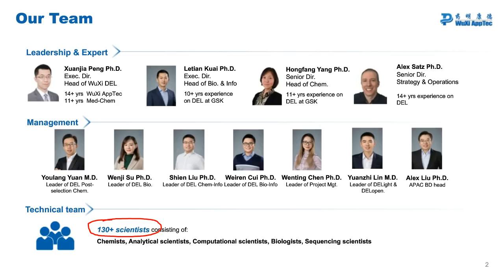So if the protein can be solubilized, then we can run a DEL screen on it, and it's very doable. As far as the historical hit rate goes on solubilized protein targets, it's probably a little lower, and I think that's due to the quality of the protein itself. But for the most part, I would say if the protein quality remains high, then the screen will go smoothly and you will find hits.